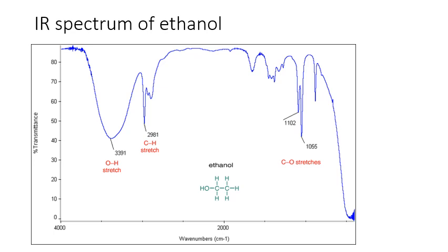So as you can see, the OH stretch comes in quite high energy at 3,391 reciprocal centimeters. Then come the CH stretches and the corresponding CO stretches. Essentially, this is what you would see of a spectrum. You have the percentage transmittance, which ranges between 0 and 100%, and this way the functional groups can be identified. The characteristic ranges of infrared absorptions of various bonds in different classes of molecules and different functional groups are given in your data book.